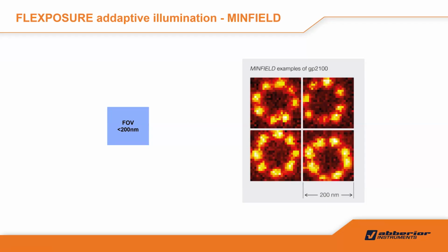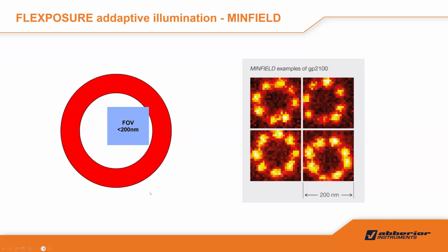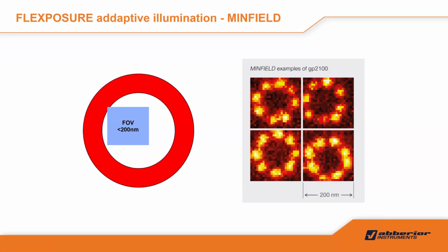It's just one dot. In a normal conventional confocal, you scan 512 times 512, right? You have so many dots. We are only imaging one dot from that large frame. We have the STED beam just circling around that dot to boost the resolution. For example, that's a nuclear pore complex. The diameter is below the diffraction barrier, 200 nanometer.